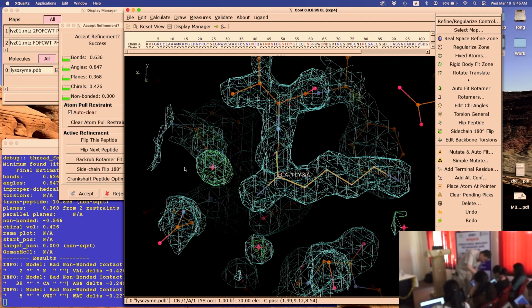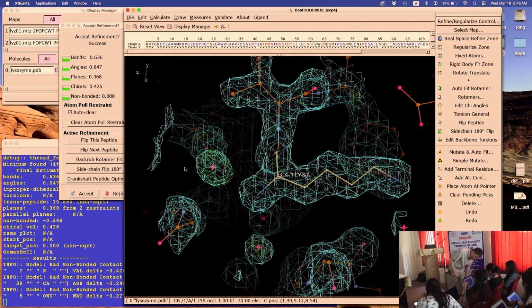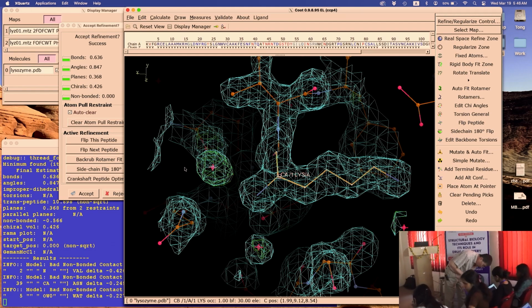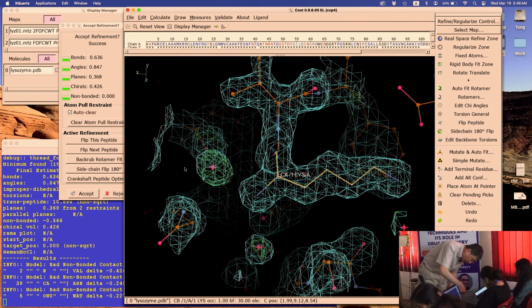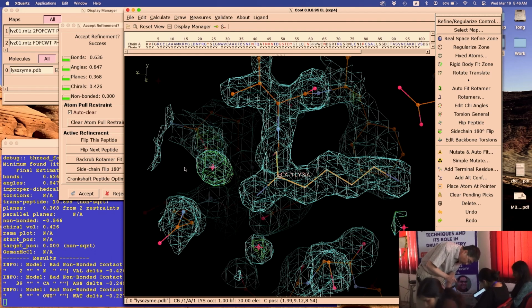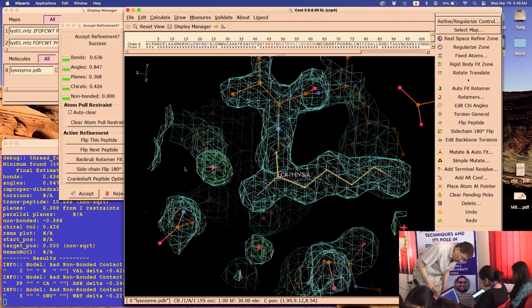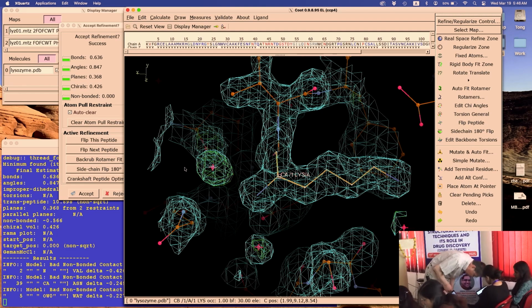Add terminal residue. Yeah, click on any atom on the valine. No, click on the atom. Don't click on the density. Did you select add terminal residue? No, add terminal residue near the bottom. Terminal residue. Right. Select that and click on this. So what to select? Just click on the command and then, okay. Click it. Click on this, yeah.